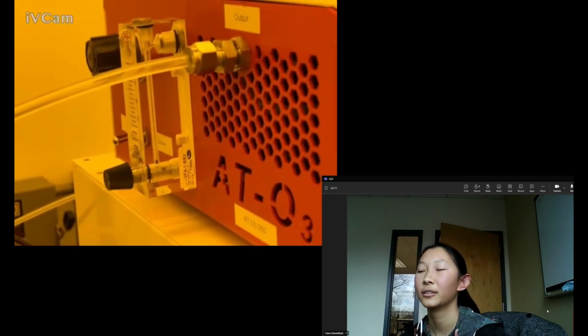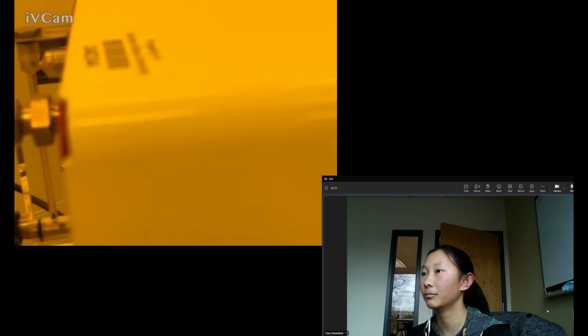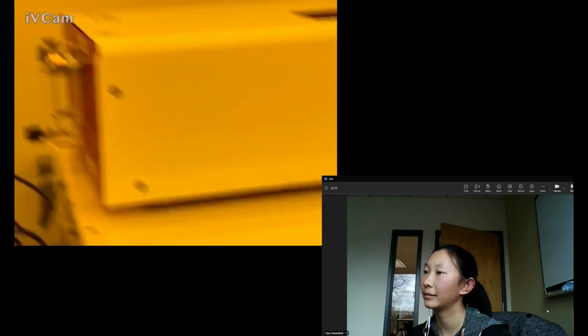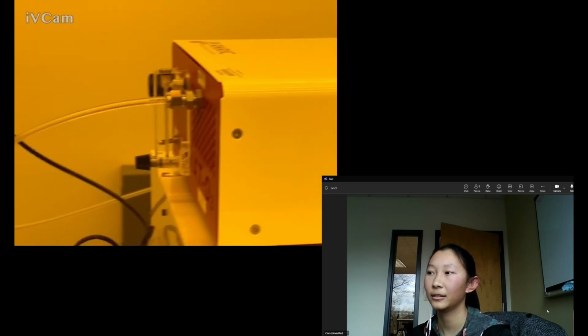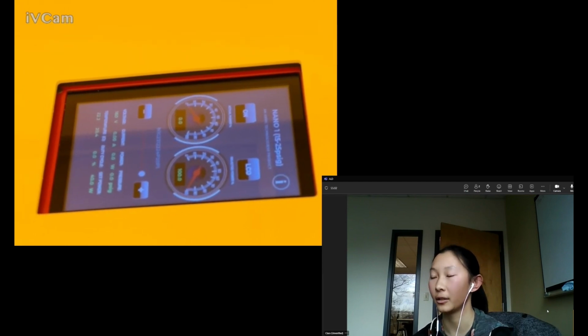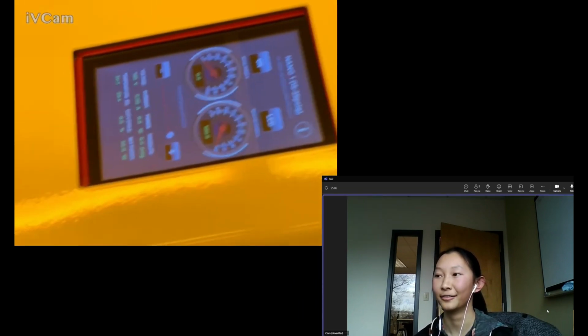Oh, now I hear something. It's still at 0, but it's like a little popping sound. Maybe not hissing. No, there's no hissing sound. If there's supposed to be a regular hissing sound, there's nothing. That's a good thing. Okay, that's a good thing then.